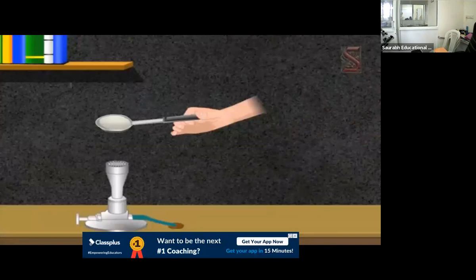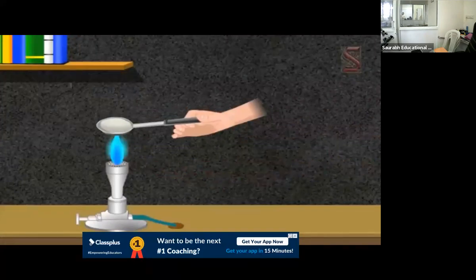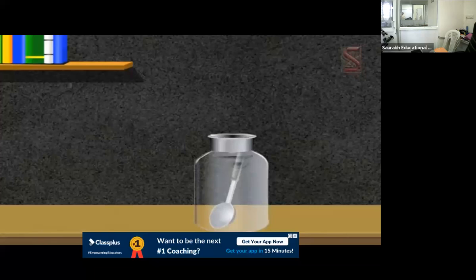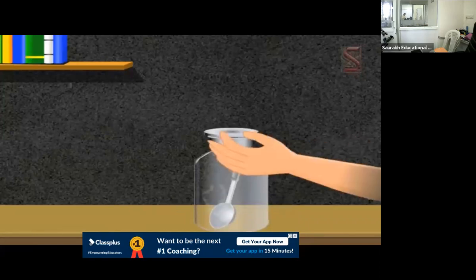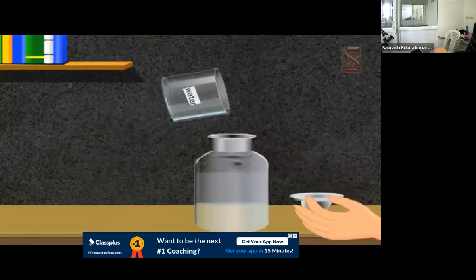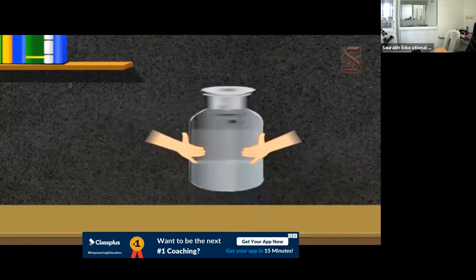Take a small amount of sulfur in a deflagrating spoon and heat it. As soon as the sulfur starts burning, introduce the spoon into a gas jar. Then, cover the jar with a lid. To ensure that the produced sulfur dioxide gas does not escape, remove the spoon after some time. Add a small quantity of water into the gas jar and quickly replace the lid. Shake the gas jar well.